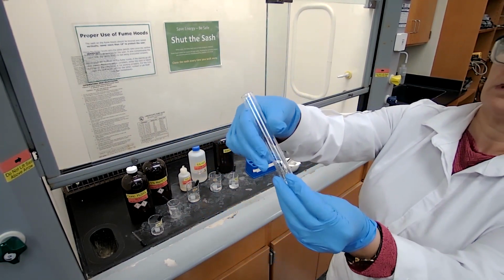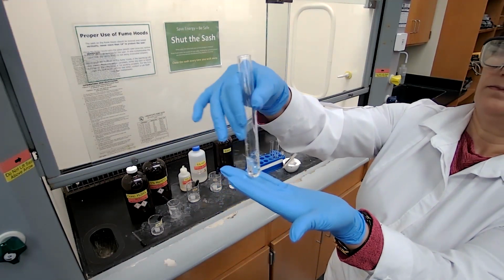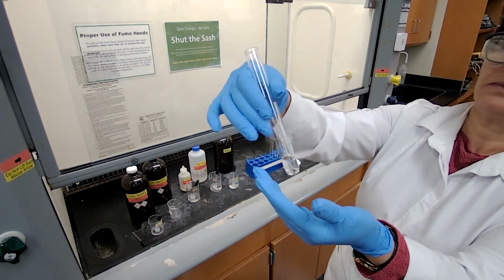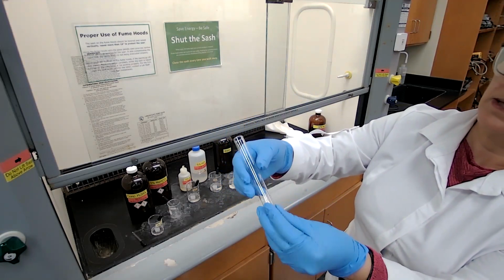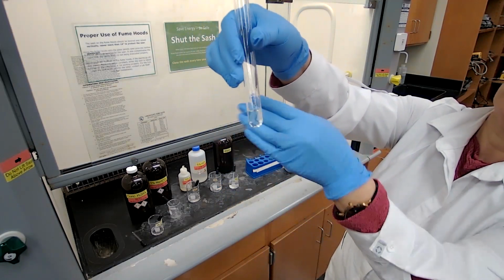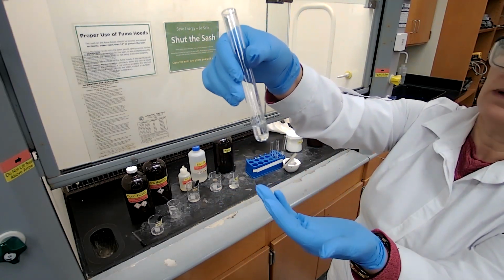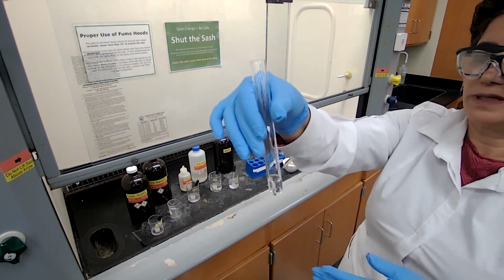The solution turned clear because the solid is in the liquid. If it disappears, that means it's soluble. So the conclusion here is that the compound is soluble. There is a slight color change, but since the solid disappeared, we can already say that the sample is soluble in sulfuric acid.